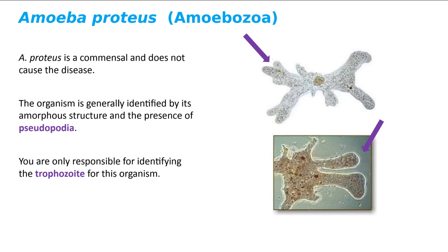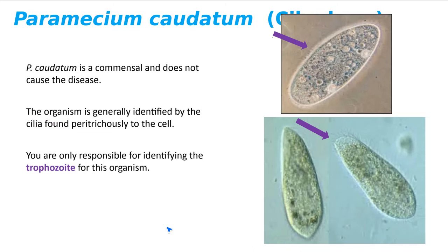This is Paramecium caudatum. It's also a commensal — it doesn't cause infection. It's oval in shape and has all of these very fine cilia surrounding the entire structure. It's a classic example of a ciliate.